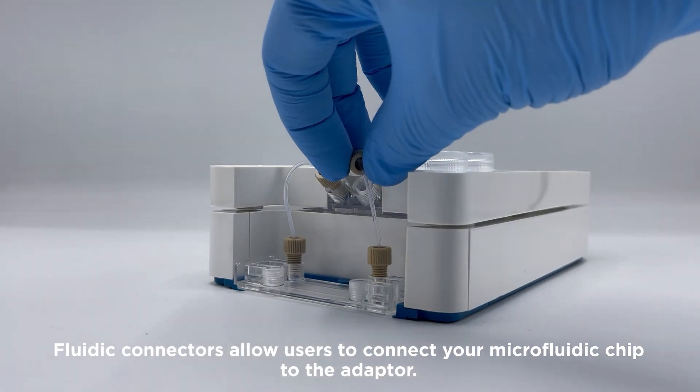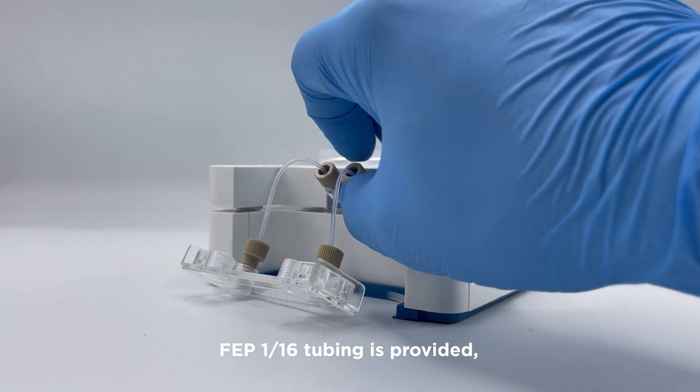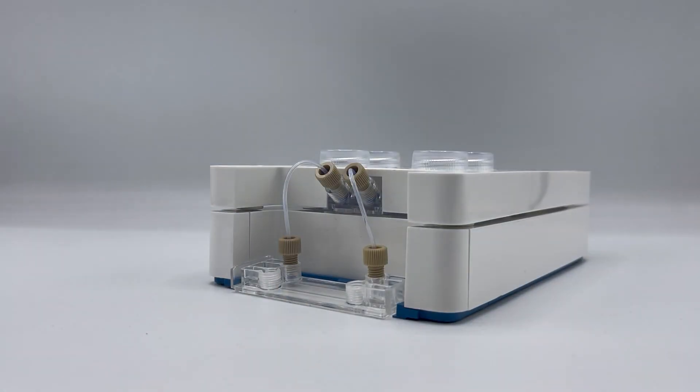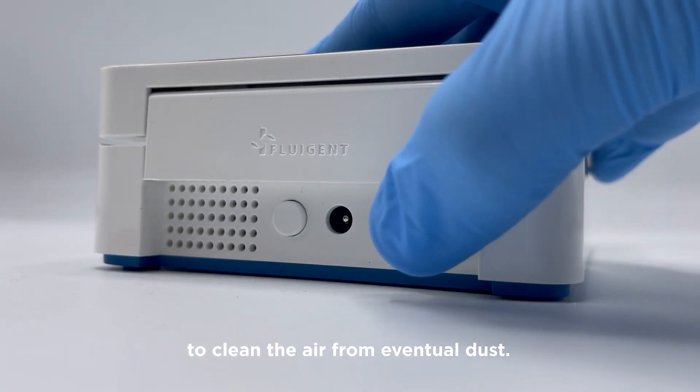Fluidic connectors allow users to connect your microfluidic chip to the adapter. FEP 1/16 tubing is provided, along with a tube cutter and adaptive connectors. The filter is placed on the back of OMI to clean the air from eventual dust.